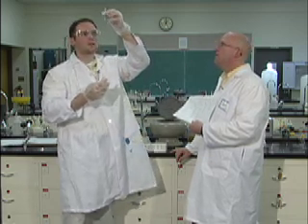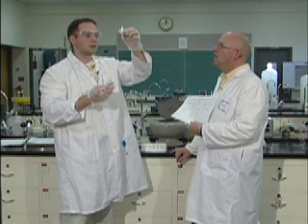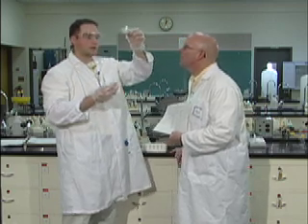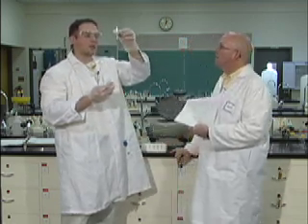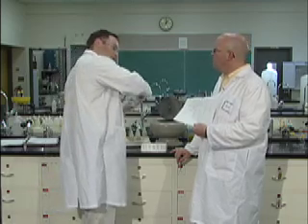You're putting that stuff on the edge so it slips down there, and then we should get... you can see that the iron has stayed out of solution and the aluminum has gone back in. So again, we have a jelly-like precipitate formed. Now it's important at this stage, since we still have a precipitate, that we centrifuge again.